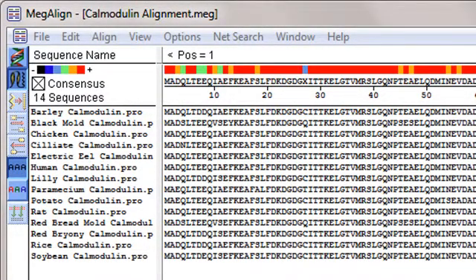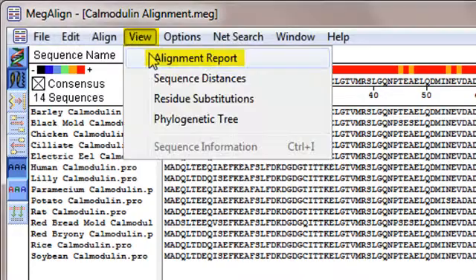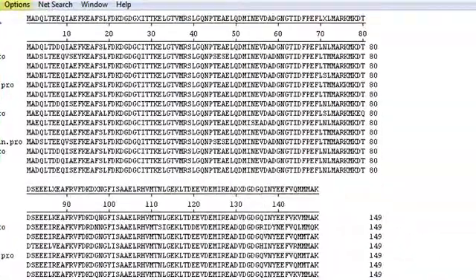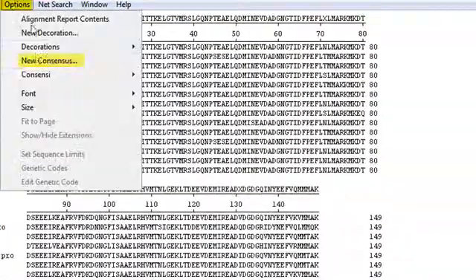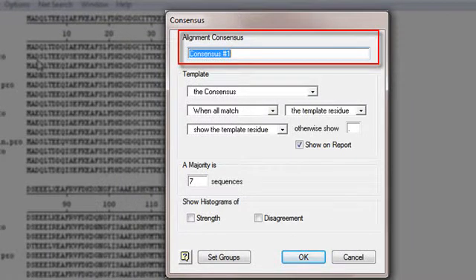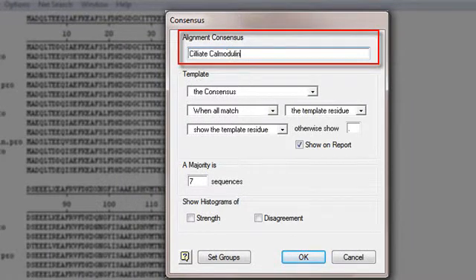To do this, I'll go to view alignment report. Next, I'll choose options, new consensus, and type a name for the consensus in the alignment consensus field. In this case, I want to find out how different species calmodulin compares to ciliate calmodulin.